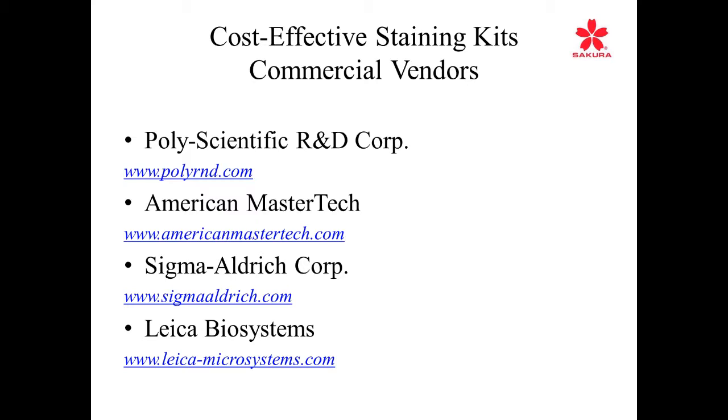But certainly, these kits are very good for you to be able to learn what you're doing, even if you are using automation. So doing the step-by-step procedure will give you a better understanding of each step, as we talked about in the mechanism of staining.